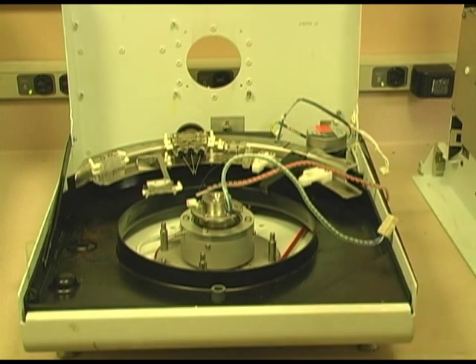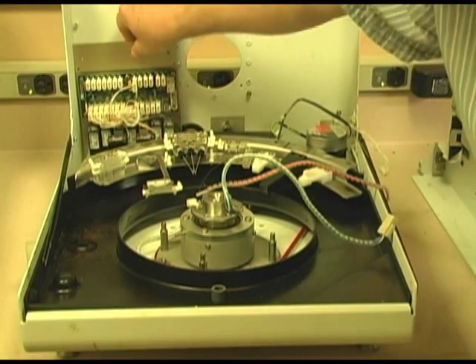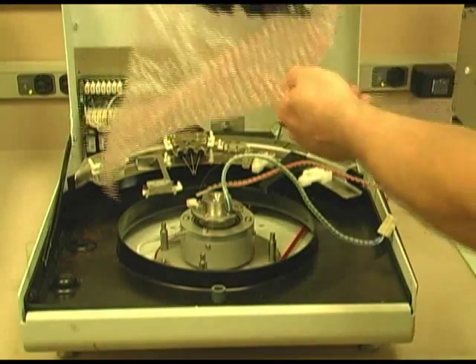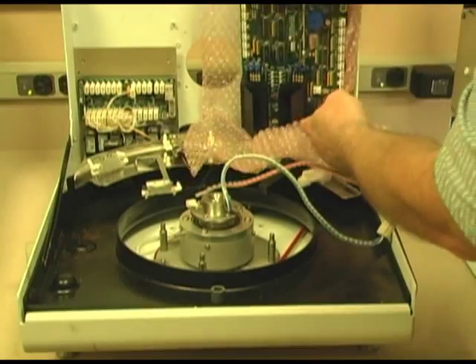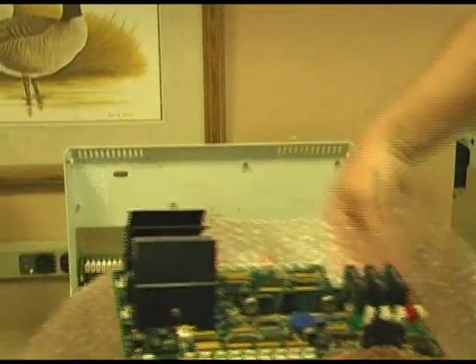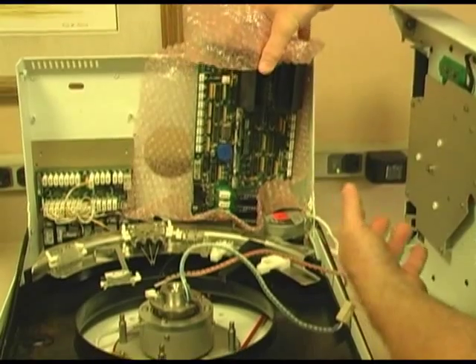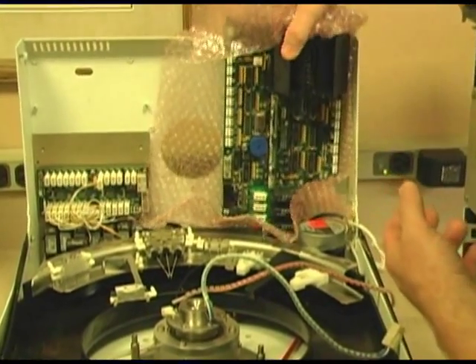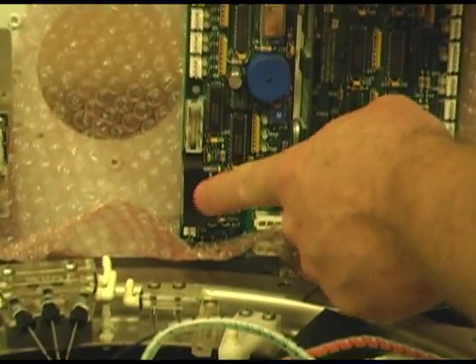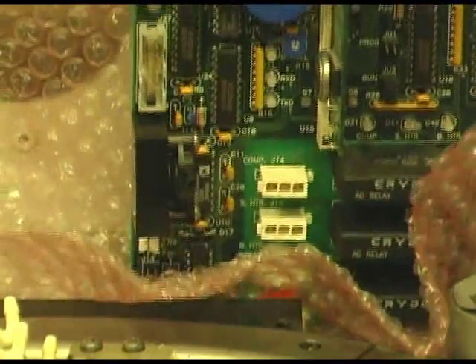We'd be putting in the I.O. board and some modules right back there — a controller board, a microprocessor board, right into this little corner. I will point out that there is a pressure gauge, strain gauge, to monitor the air that comes into the system.